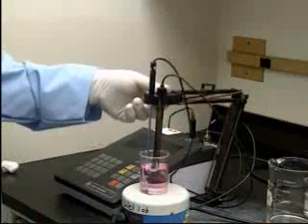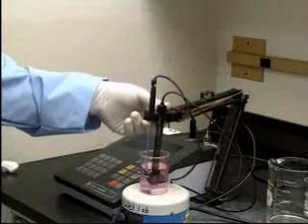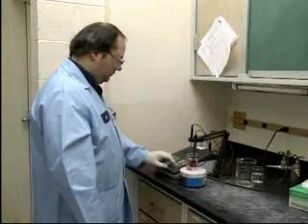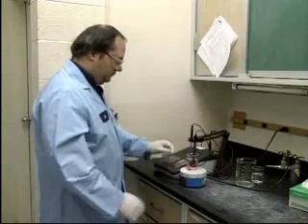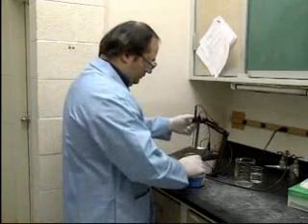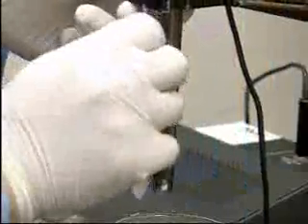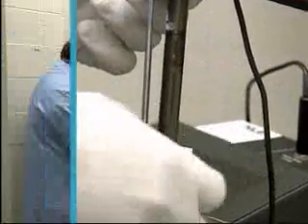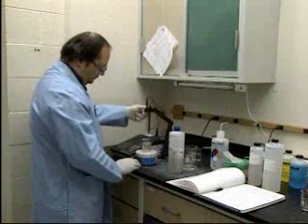The beaker is placed on a magnetic stirrer to make sure the solution is homogeneous. This, in turn, helps to ensure an accurate pH measurement. After using the meter controls to enter an expected pH value of 4, the probes are immersed in the buffer. The pH meter is then standardized for the temperature and pH of the buffer solution. All that's left to do before the sample is tested is to clean and dry the probes again. Now the sample can be tested.